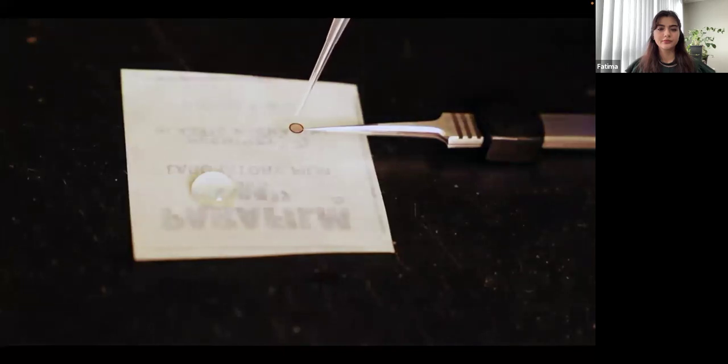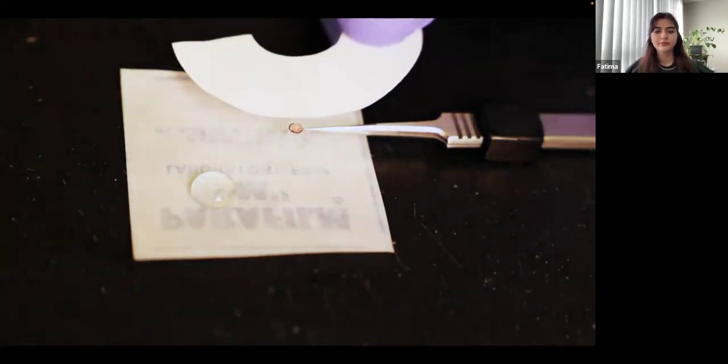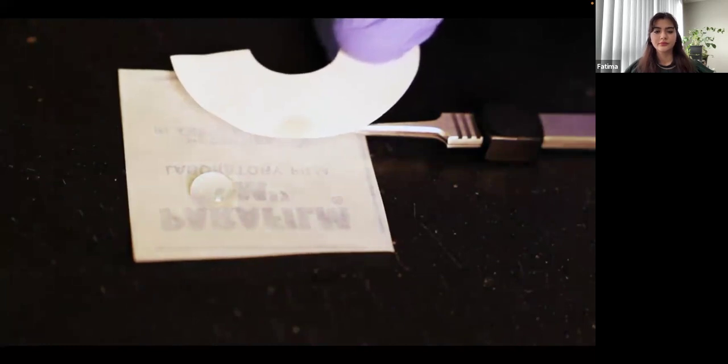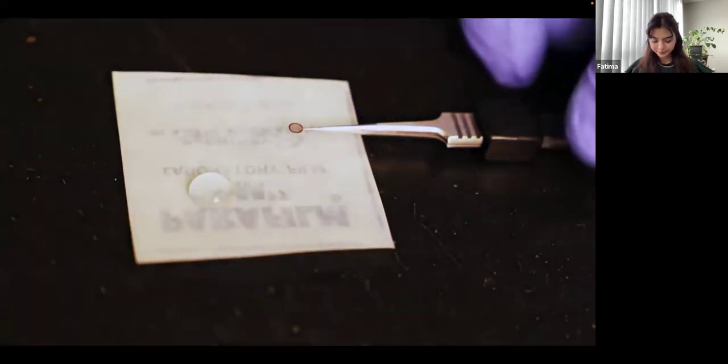Next, 2 to 4 microliters of sample is pipetted onto the prepared grid and allowed to adsorb to the surface. After around a minute, the excess sample is blotted away using filter paper.